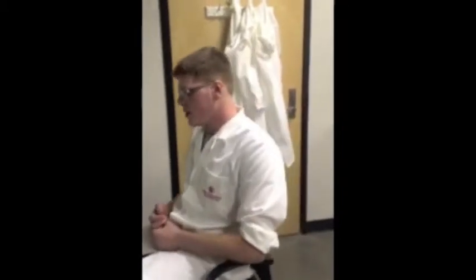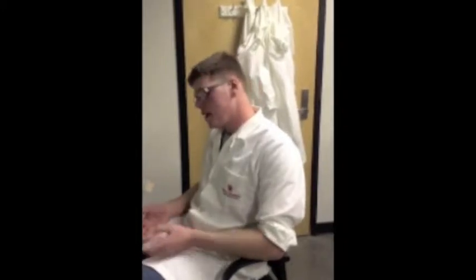Hello there. I'm Raleigh. I'm a sophomore at the University of Colorado Denver, working in the Bland Lab, and I'm going to show you cresyl violet staining today. Cresyl violet is a compound that is used to stain Nissl bodies within rat brain tissue. A Nissl body is an aggregate of ribosomes, which are the site of protein synthesis. So we use this to better visualize the samples when using light microscopy, specifically to determine probe placement for microdialysis testing.